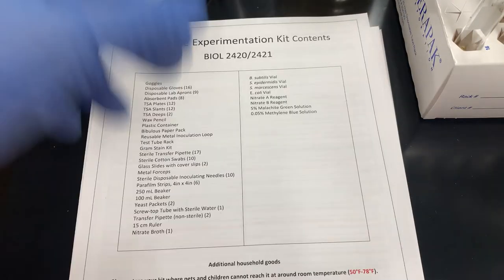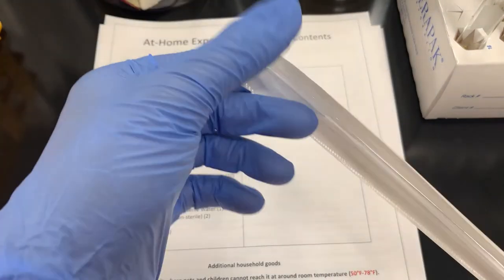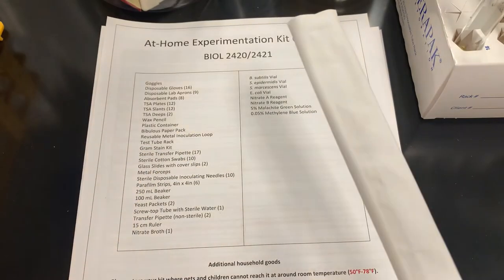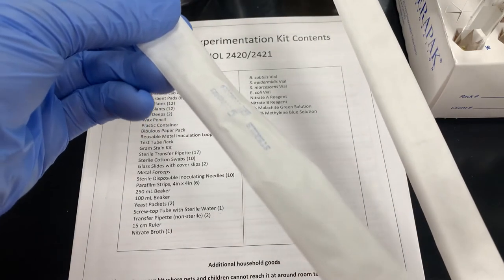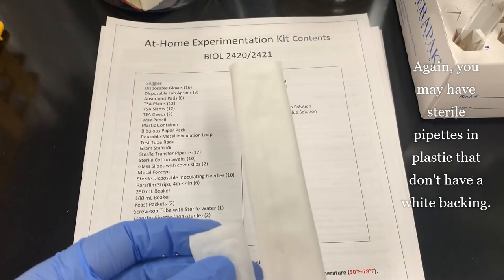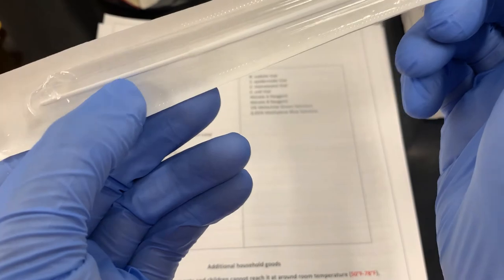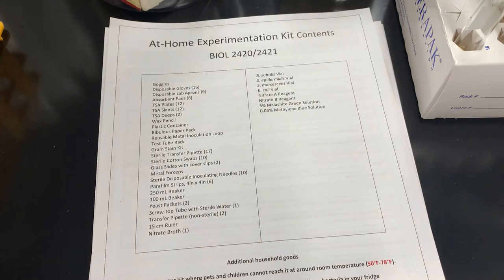Next we have sterile disposable inoculating needles. These look a lot like the sterile transfer pipettes in the fact that they have a white back and a clear front. However, the transfer pipettes should have blue marking on them, okay? Also, these are much, much longer. As you can see, the disposable needle is much, much longer. Now, it also has the tabs at the top where you're gonna pull it apart and you're just gonna grab at the top here. You're also gonna hold it like a pencil because if you can see, this bottom part down here is thinner than the handle. Okay, that's what you're gonna be using to stab into things, into agar tubes, not other things.